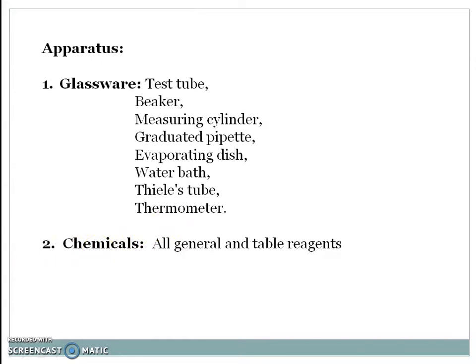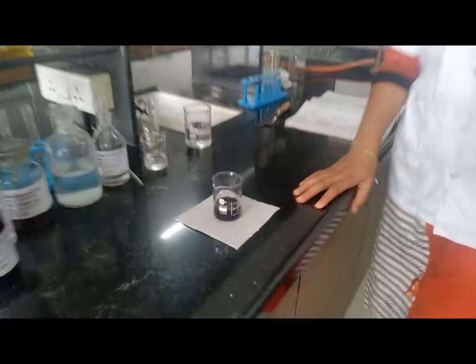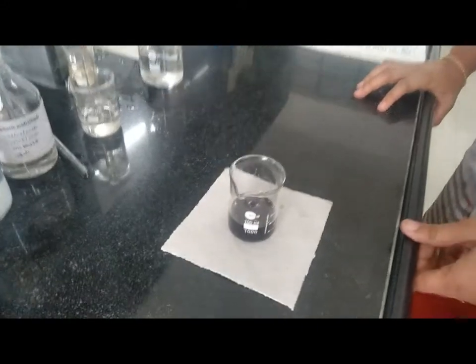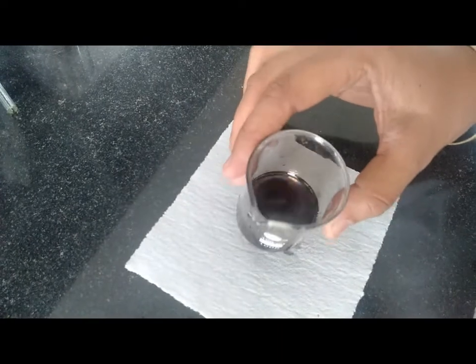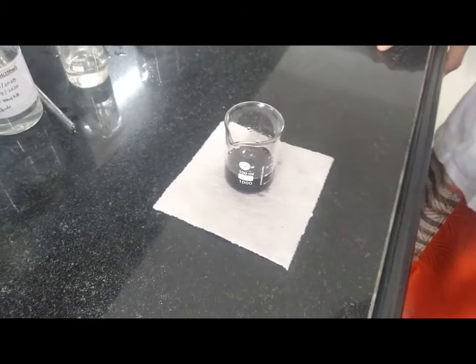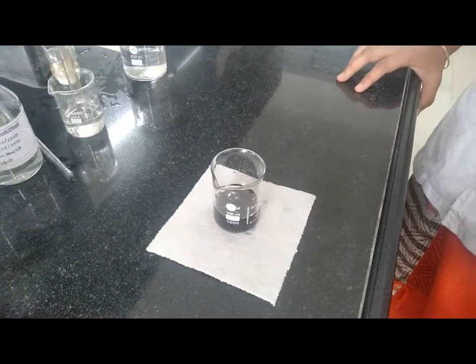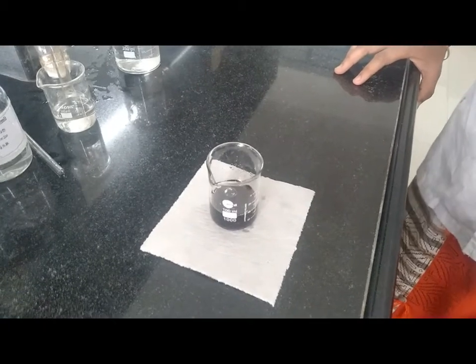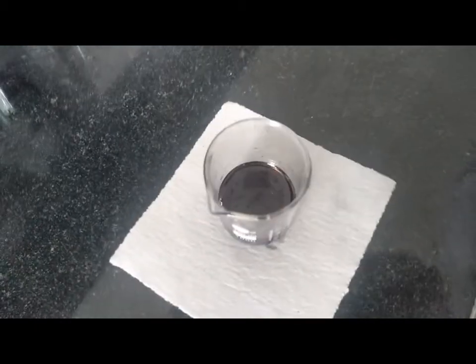For the actual stepwise procedure, we move to the laboratory. In our pharmaceutical chemistry laboratory, today we are going to deal with systemic qualitative analysis. Let's start with our new organic compound. The color of the organic compound is reddish brown, and it has an amine-like odor. That means azo group, methyl orange, beta-naphthol, or amino compound — an amino-like benzene group — may be present.